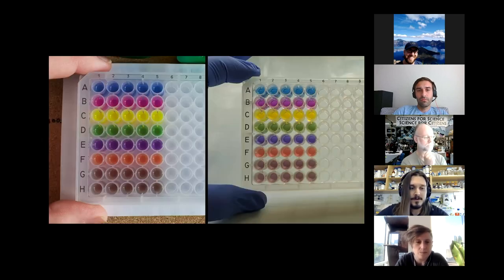So I decided to play around with mixing proteins. I extracted the blue, pink, and yellow, and I started mixing them in equal volumes. This is just extract with nothing else, not a fusion protein or anything. And I'm starting to get a beautiful green. Green chromoproteins are super rare if they're not metal binding, like chlorophyll or things like that.